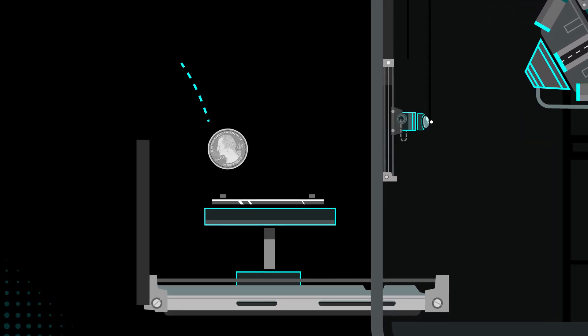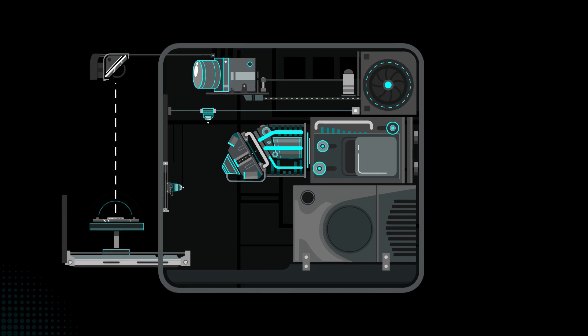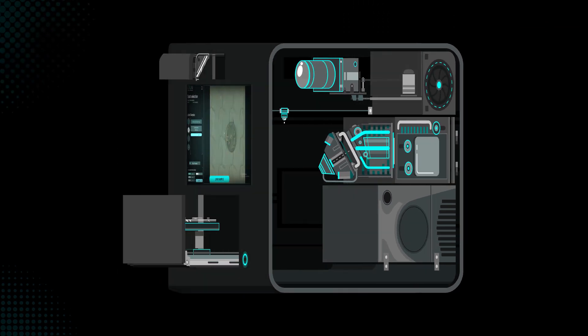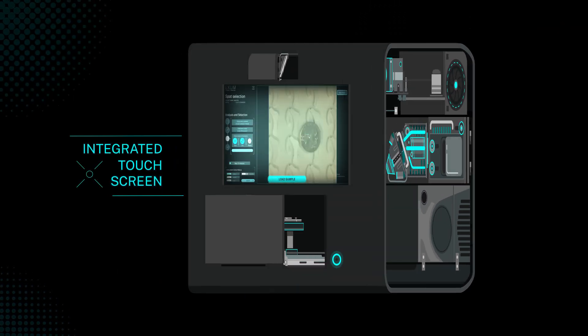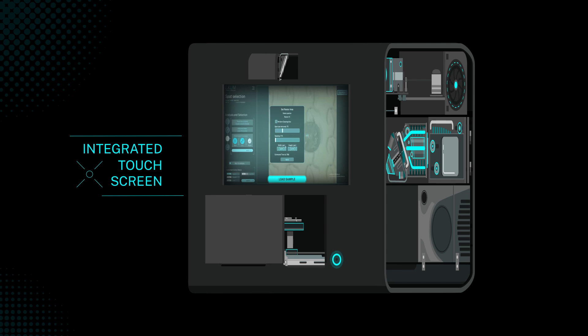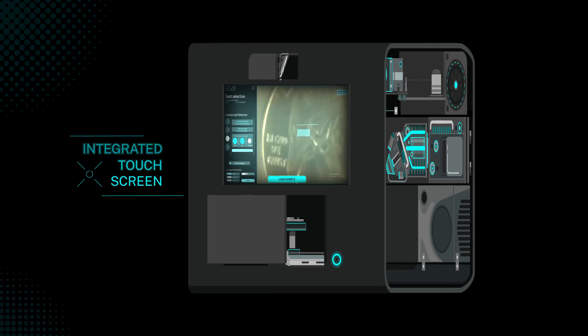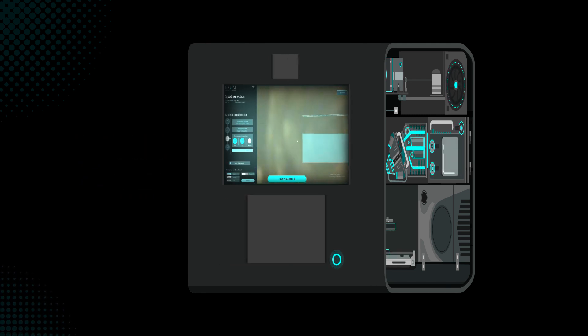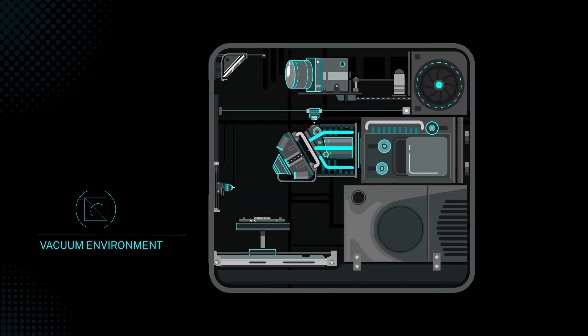Start by loading the sample tray with your solid material from a pressed powder to a finished part. Then, use the integrated touchscreen to choose points for analysis and press go. The sample chamber is pumped down to a high vacuum environment.